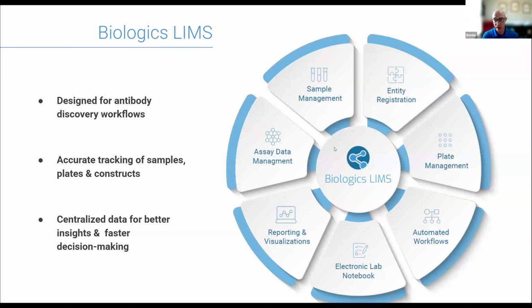I'm of the opinion that you shouldn't be running 3 or 4 or 5 or 6 different pieces of software to help manage your data. You don't need an SDMS and a LIMS and an ELN, separate analysis software, and a bunch of spreadsheets in order to do this. There do exist products like our Biologics LIMS that are really as close to all-in-one scientific data platforms as you can get. And I just want to give you a glimpse into what that looks like and what some of the advantages are of using tools like this.